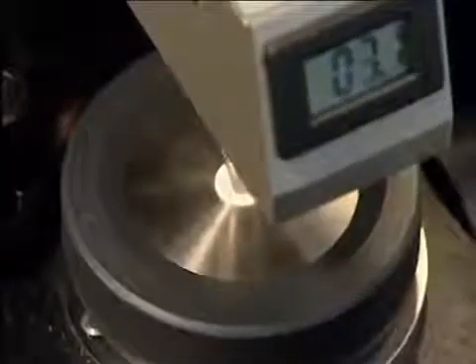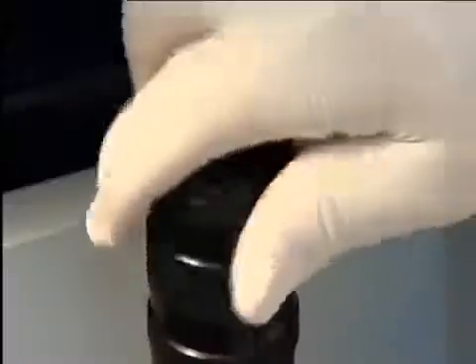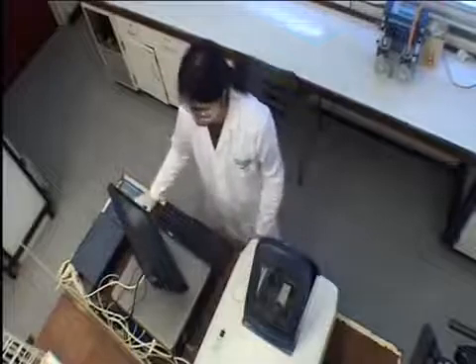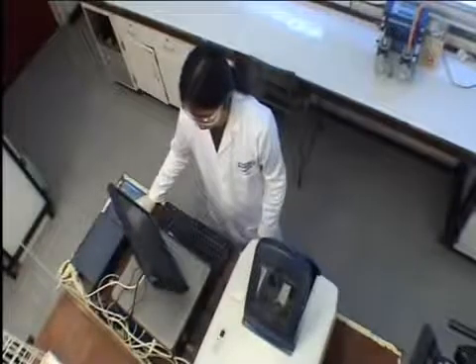For most samples, no preparation is required. Details of the scan are entered into the computer. The spectrum of the sample is obtained within a few seconds.